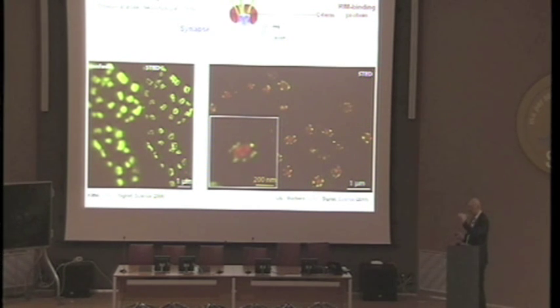You take different views from different directions. So this is the confocal recording. Even after some mathematics, you don't get better than this. And this is what you have here in the STED microscope. And then you can come up with a three-dimensional model of how this protein is arranged in space. You see the numbers here, 40 nanometers, 50, 80, and so on.